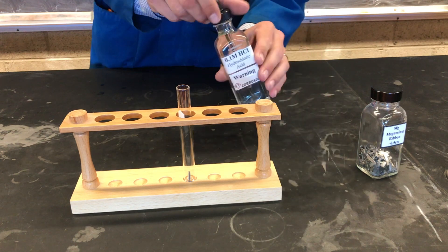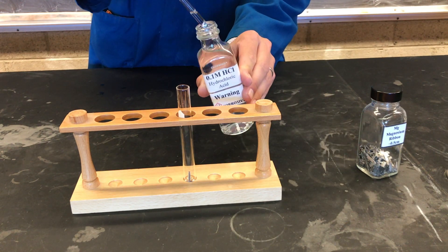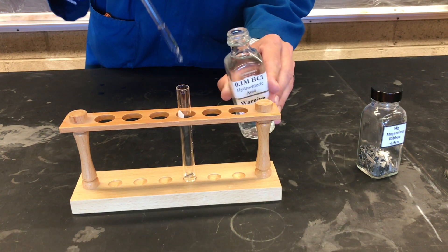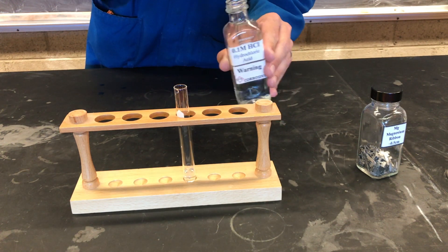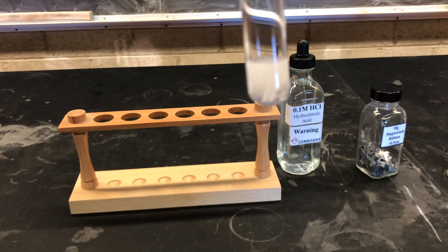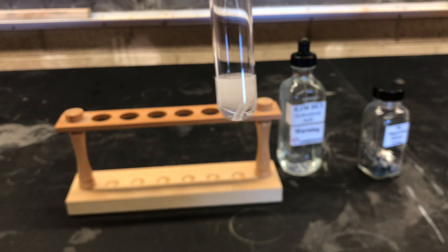We'll add about 20 drops of the acid solution to our test tube. We can note the gas being evolved and make our observations. Properly dispose of waste in the labeled container and clean your glassware.